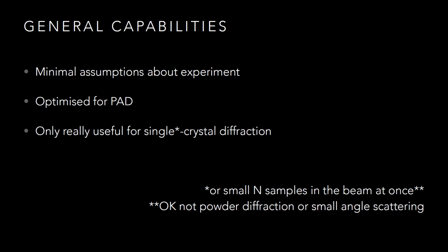you can have lots of single crystals, but we don't do powder, we don't do small angle scattering, we don't do all the stuff that was being talked about earlier with the easy diffraction stuff.